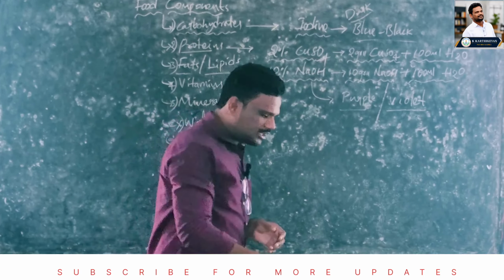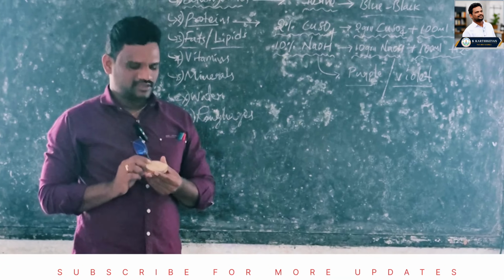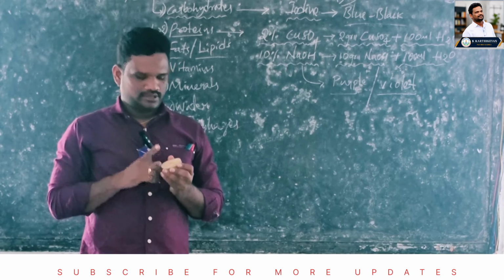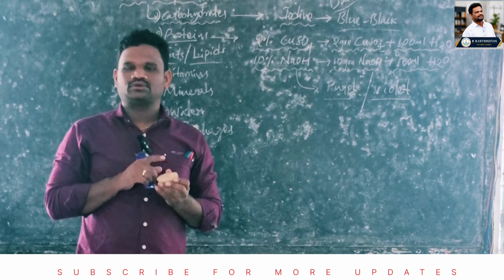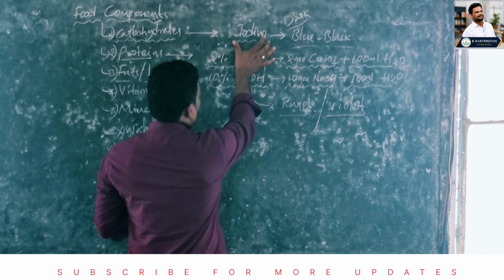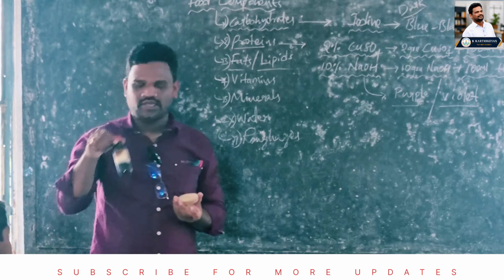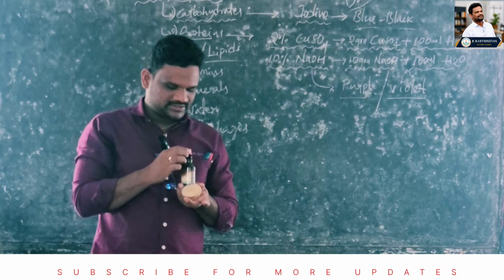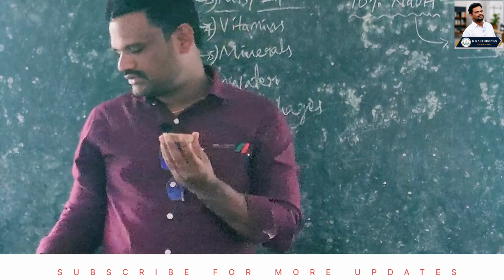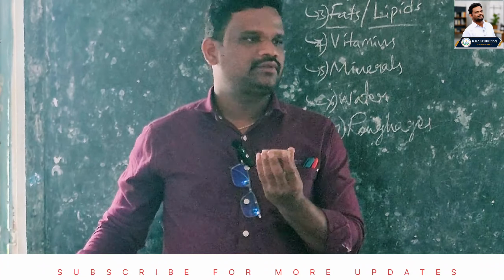Already you know that carbohydrates are present in potato, rice, wheat, etc. Okay. Now we have potato. Potato means it has carbohydrates. Now we are confirming whether potato has carbohydrates or not. What we have to do? First we have to take iodine and add it onto the carbohydrates. Okay, let us say this is iodine. Now let us add iodine onto the carbohydrates. Let's wait for some time, only a few minutes. 1 or 2 minutes is enough to react with the carbohydrate.